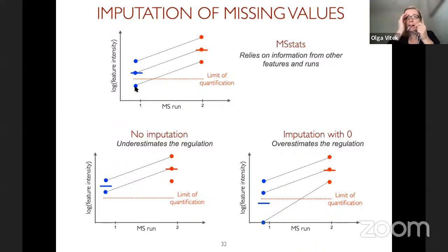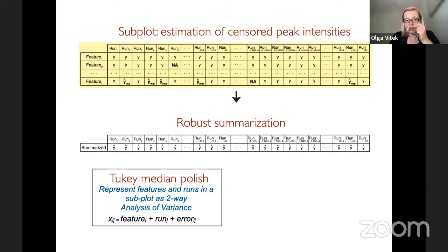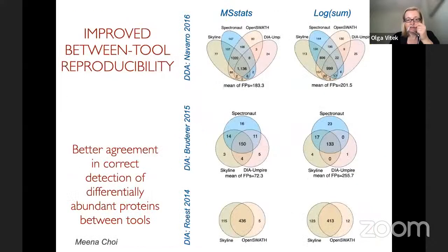As I was saying earlier, MaxQuant is very generous with missing values. So those missing values may come from other situations. Well, we always have the option to just leave missing as NA, in which case we will have something like this. I would say more work is needed, especially for these more recent workflows and PTMs and so on. So we will certainly be working on that. For now, this type of imputation is an option. So you can use it or you can leave it out if you would like.